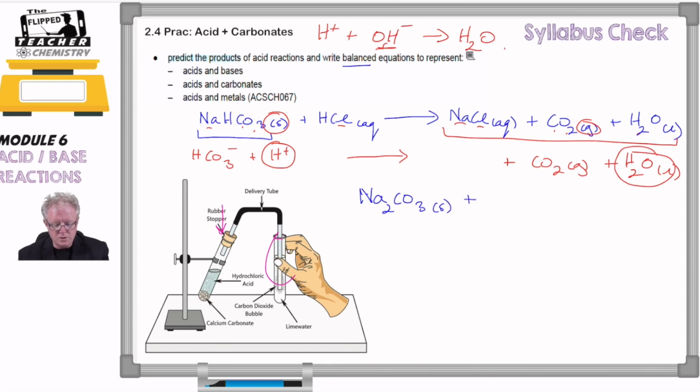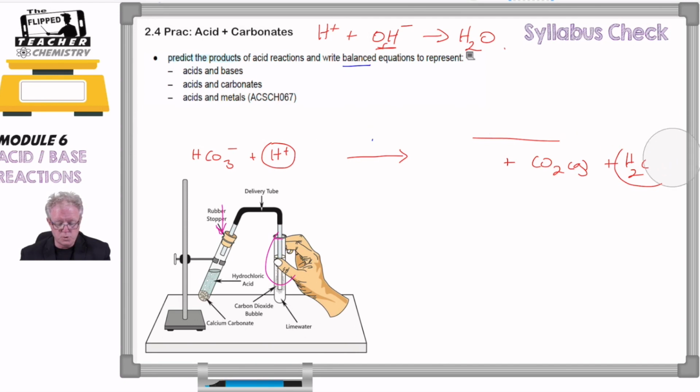Okay, and then we could do the same thing. So let's just change the acid. I'm just going to erase that out. I might actually erase everything out. So if you haven't written that down yet, make sure you press pause and write it down, because it's going. There it goes. Gone.